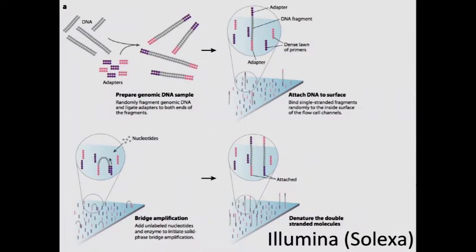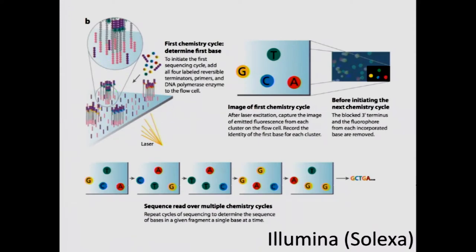You've gone from one to two, and of course you do many, many more cycles, and now you have what are essentially colonies. They're called polonies because they're PCR products, polonies of physically spatially separated PCR products from those original templates. Having done that, rather than a bead coated with 100,000 molecules, now you have these individual little spots that may have 10,000 to 50,000 DNA copies.